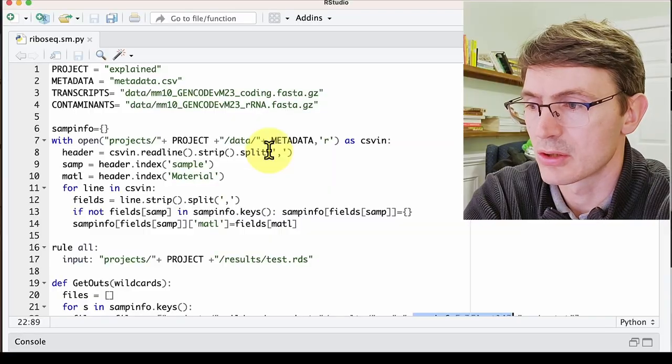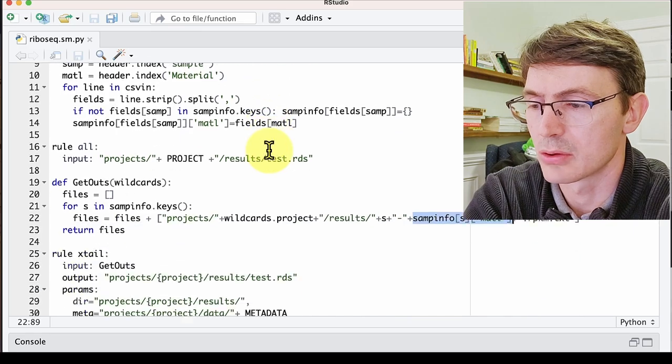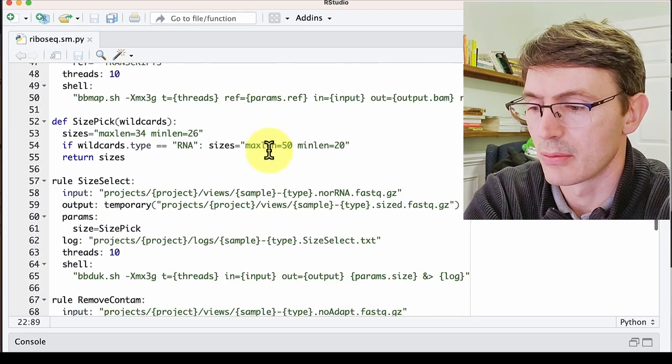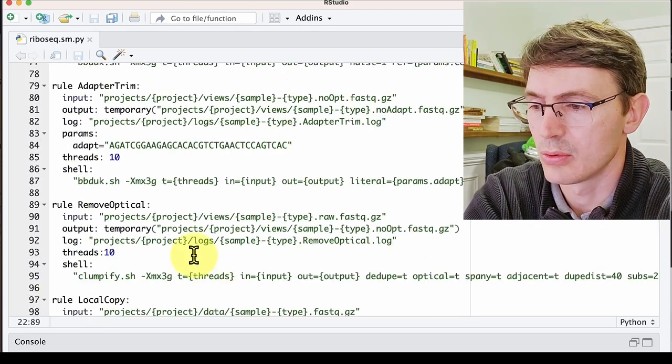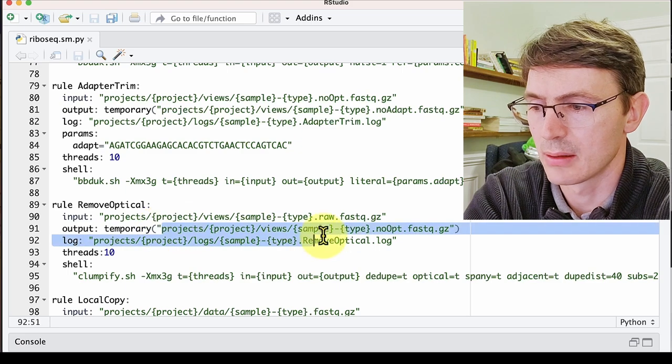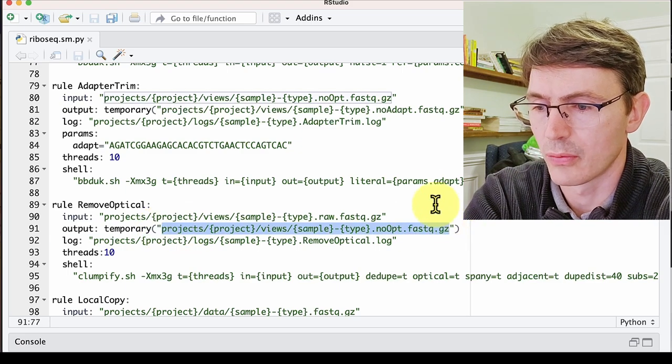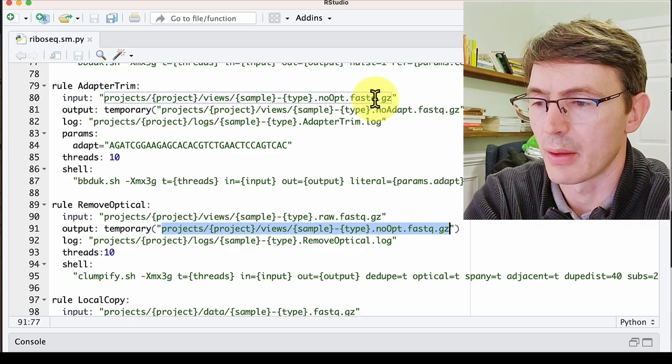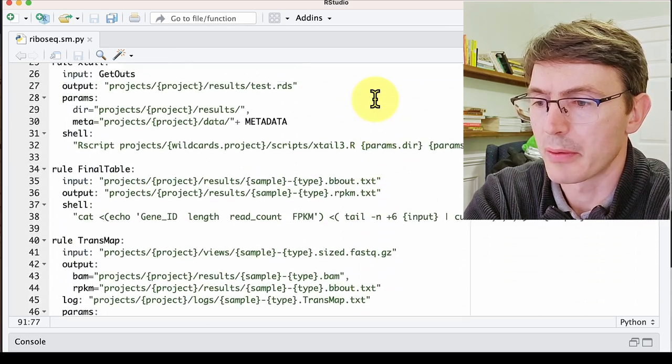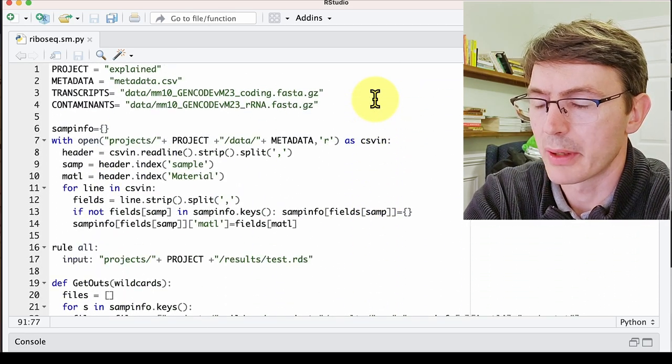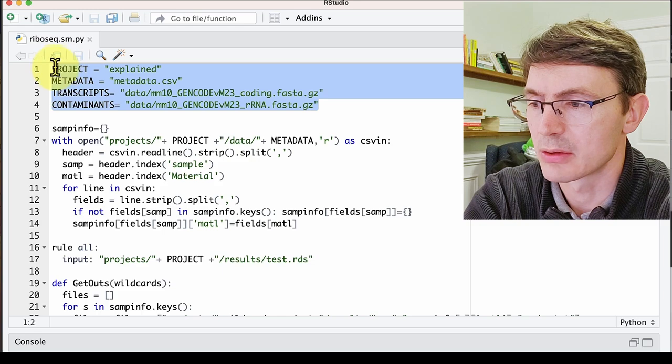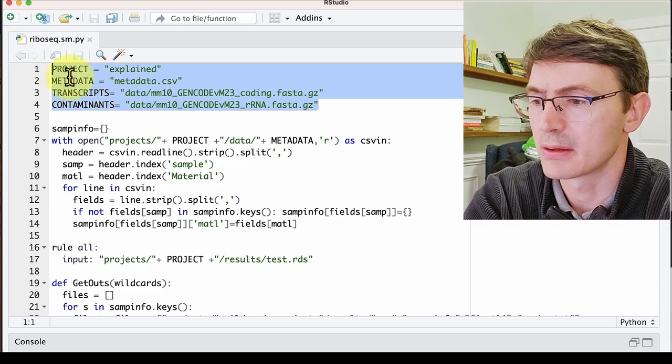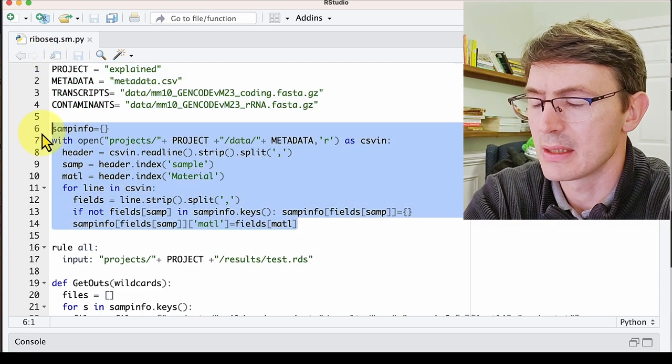So this is the script that we are going to use today, and if you scroll down you see the different rules. You can see that the rules here are easy to connect because the output of one rule fits into the input of the other one. However, if we go to the top of the script, things are a little bit more confusing.